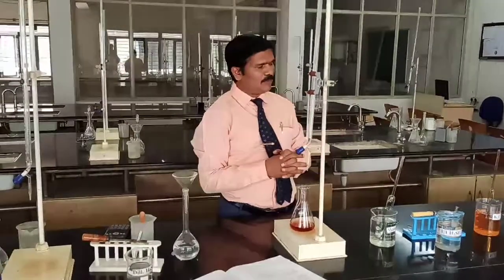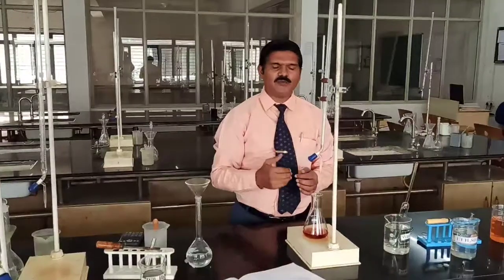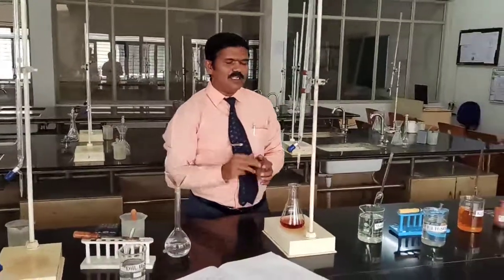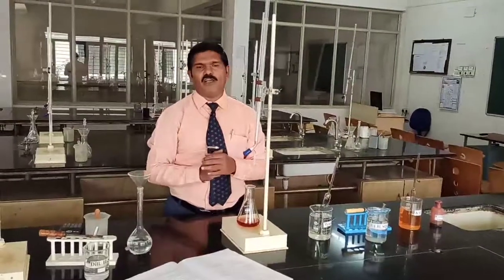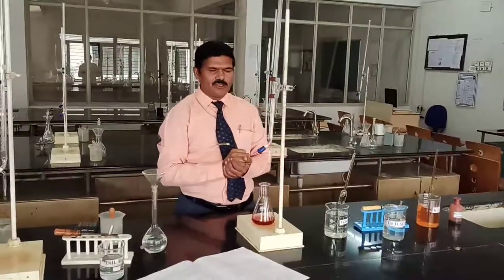You need not carry out the blank titration in the regular class lab experiments or in the examination — we will provide the blank titration value for all of you. You have to carry out 3 trials of sample titration and take the concordant value obtained during the titration.